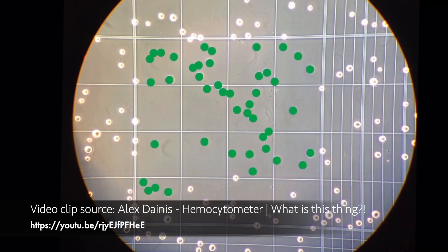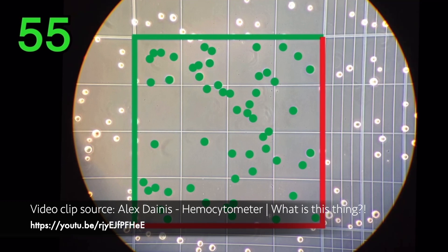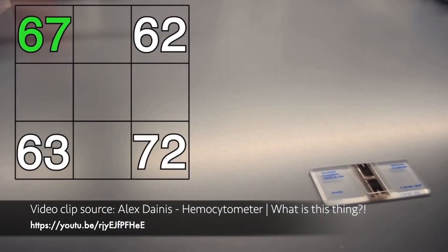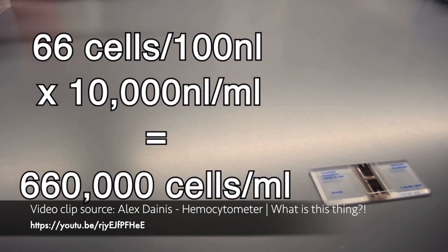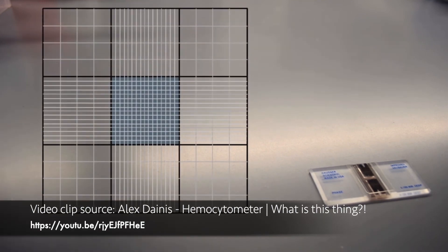If a cell lies right on the edge of a square, decide before counting which two sides will be considered in and which two will be considered out, so that you won't double count an edge cell. Do this for at least four squares and average the cells together. Since each square is 100 nL, you have cells per 100 nL density. Multiply this by 10,000 to get cells per mL. If the mixture is very dense, use the smaller subdivided squares to help count.